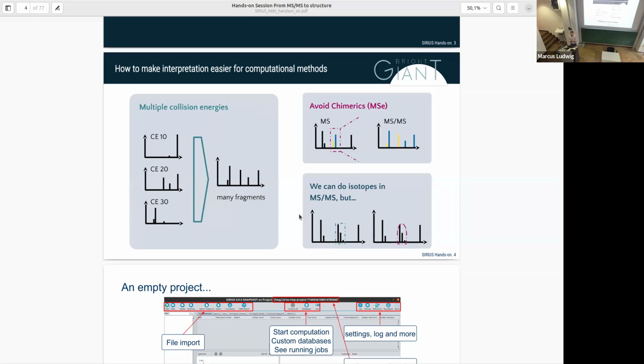And if you try to isolate this one compound and also get some of the isotope peaks in there, you don't get them 100%, you get like 50% of them, and then it distorts the isotope pattern, and this gives weird data where it's hard to get back to what's really in there. So I would say the default is just use the monoisotopic peak and you're good to go with that.